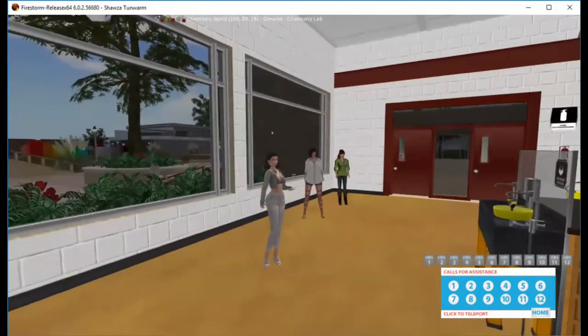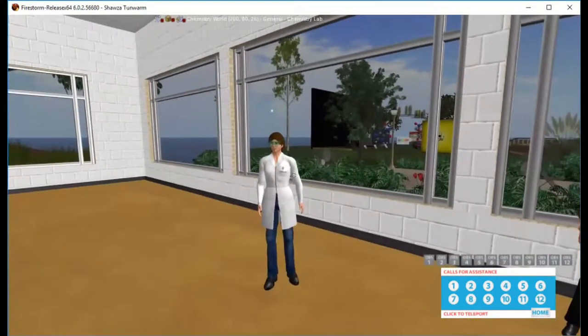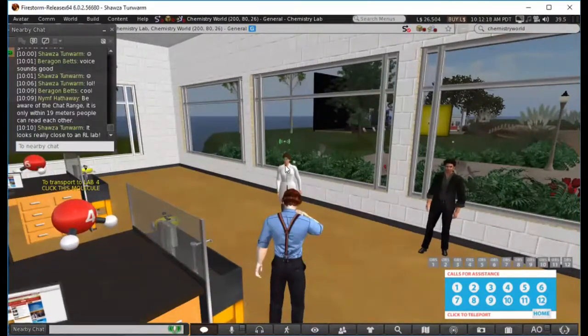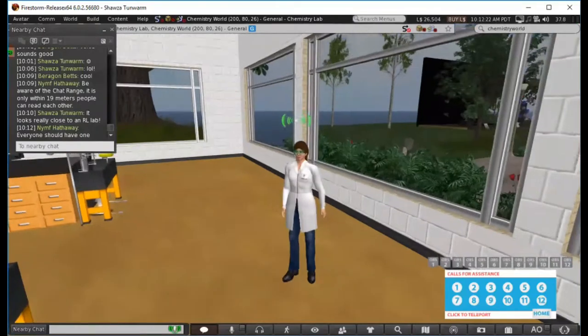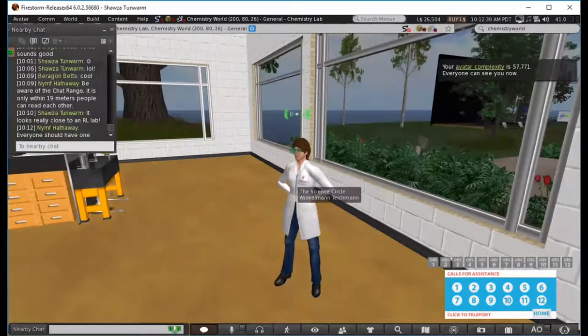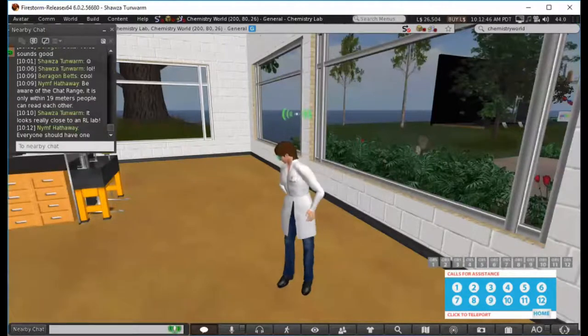So, does anybody not have the HUD? Because I think that's going to be an easier way for us to get around. Okay, we're seeing no objections to that. Let's all go to the same lab platform. Now, the HUD that you were given was designed just for the instructors of the lab course. The students did not have this. There's two sets of buttons. First we'll use the ones in the blue and white portion. There are 12 lab platforms or 12 lab stations, which is good because that means you can have 24 students doing the experiments, which is about the right size of a lab course.